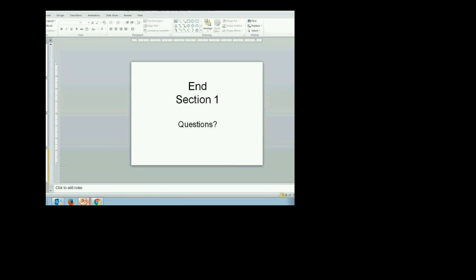Okay? So this is the end of my first section, which was very equipment heavy, very much dedicated to making sure you know how an RGA works and how to specify. Okay? So let's see how do I do this? I'm going to go to the second one now.